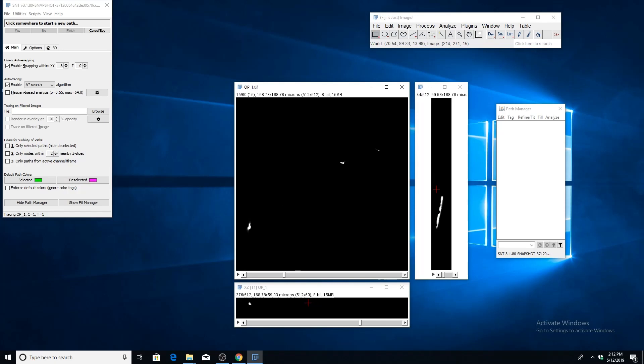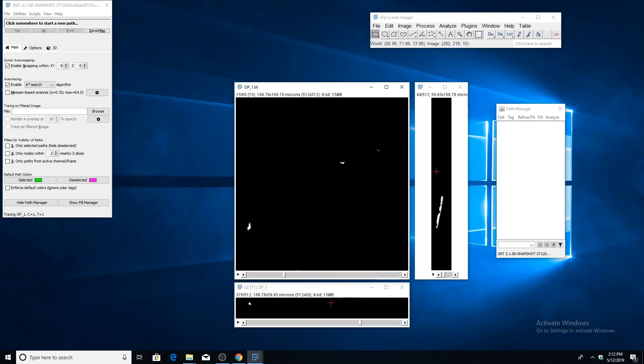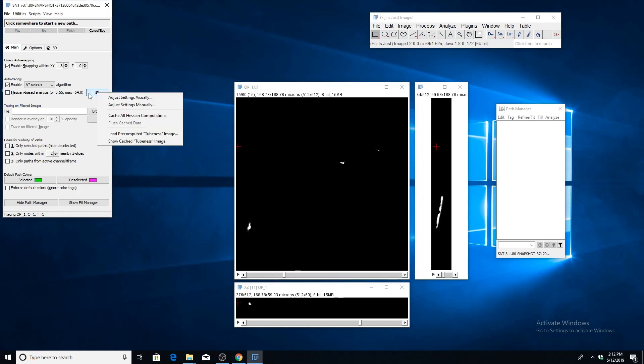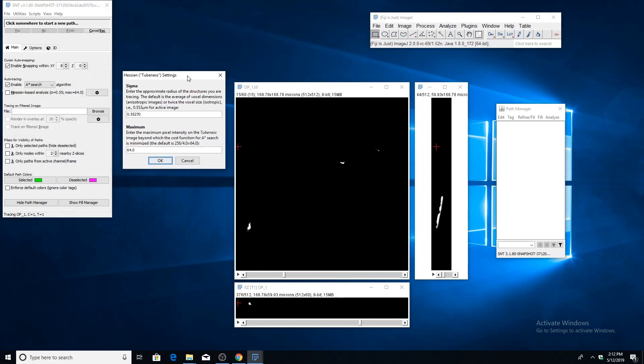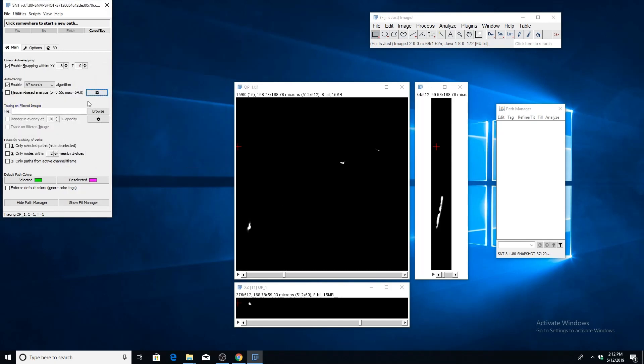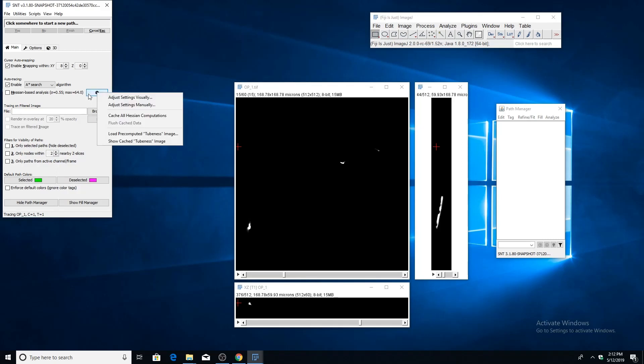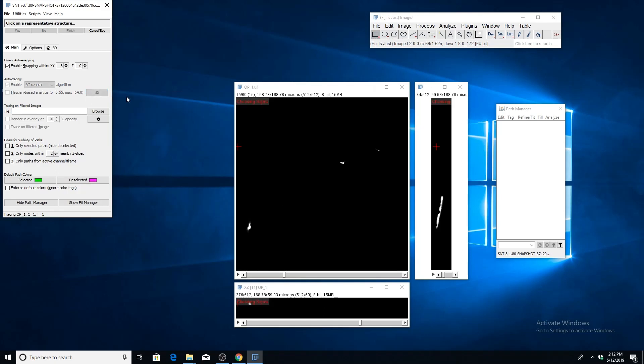The second is the maximum, which corresponds to the maximum pixel intensity on the tubeness image beyond which the cost function of the A-star search is minimized. There are two ways to choose these parameters: one is manually if you already have a quantitative understanding of the image. But for most people, it's generally easier and more intuitive to choose these settings visually.